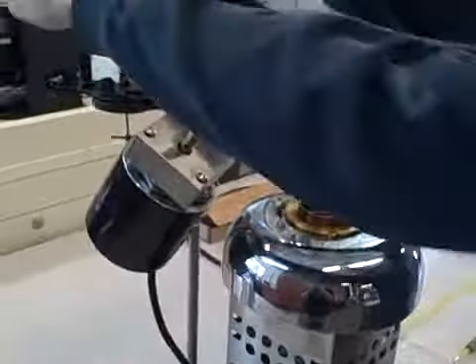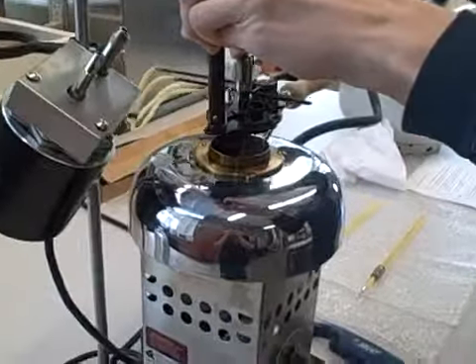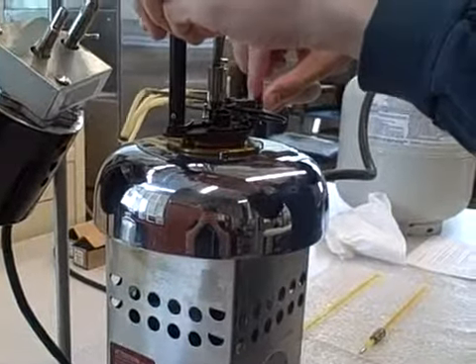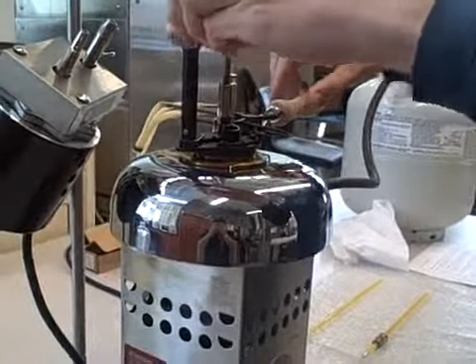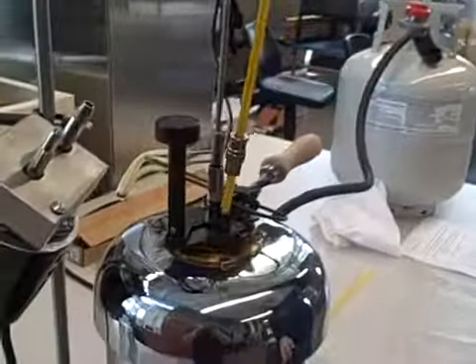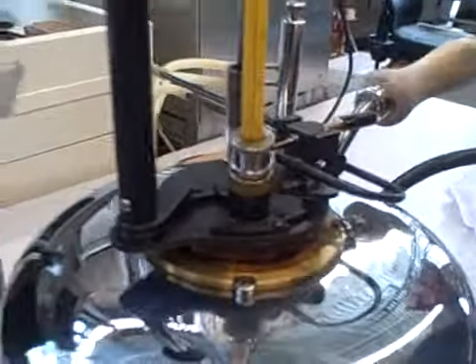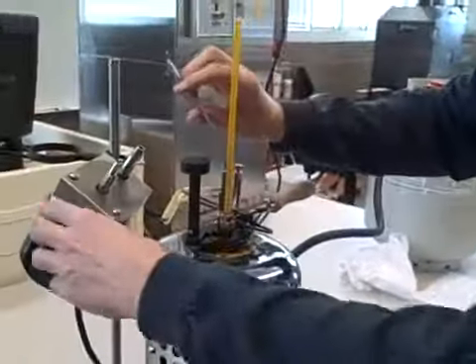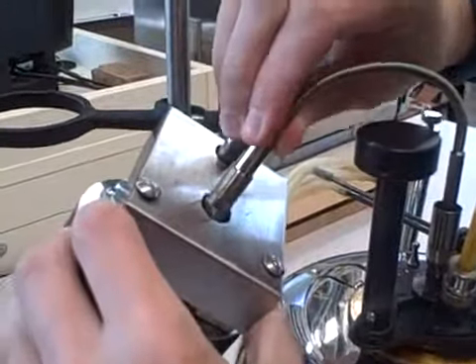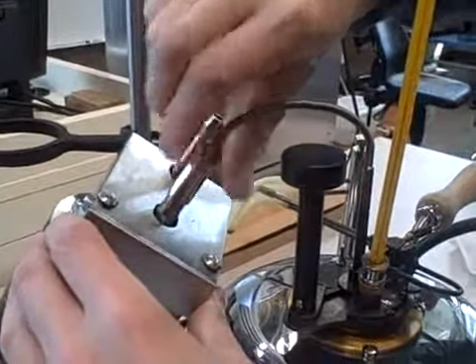Then you place the lid on top and kind of wiggle it in there so you get a firm seal. Then place the thermometer into the hole to finish the seal. Make sure you hook the stirring device back into the motor, stick it into that one there, and then slide the cover over and screw it on.